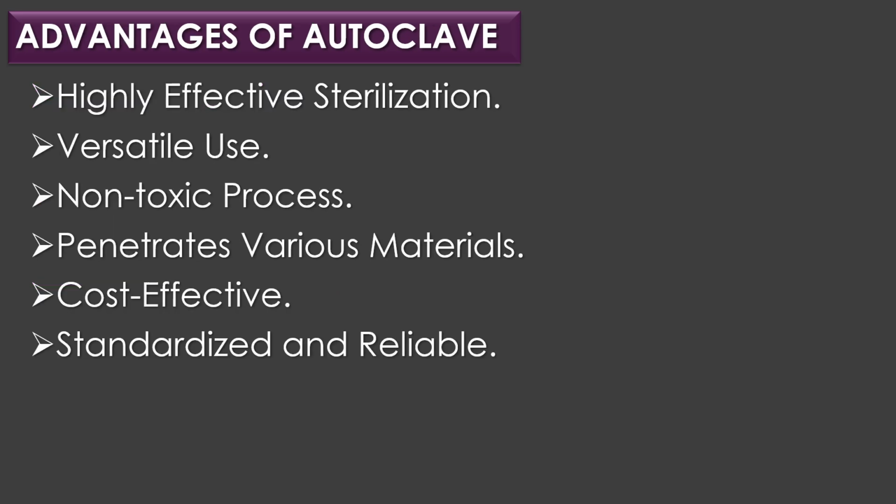Advantages of autoclave. The advantages of autoclave include highly effective sterilization, versatile use, non-toxic process, penetrates various materials, cost effective, standardized and reliable.